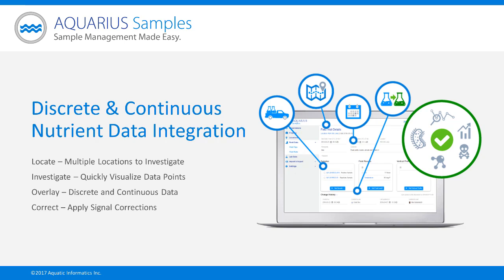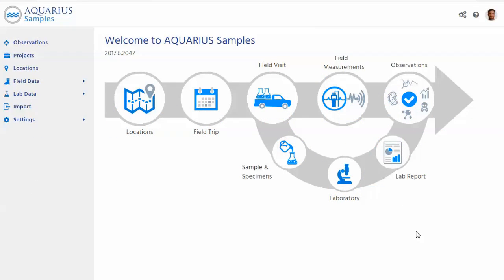So let's say someone just phoned in and told me there's a problem with some high nitrate loadings in the Patuxent River. We know that there's this Quilty Farms in that area, and they're notoriously dumping manure into the river and perhaps other places. Max, why don't we see if we can find out what Quilty's up to? Thanks, Alistair. Yeah, sure. Let's go find some of this data.